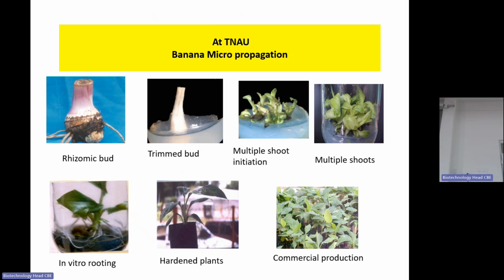Apical dominance destroyed. So you gave a vertical cut. Did you? Yes. Why a vertical cut? Multiple shoots. Just a vertical cut, not splitting it. Just a vertical cut, so you reach this meristem and you destroy the meristem. When you destroy the meristem, there will be no apical dominance. So you get many shoots, multiple shoots, all from the side axillary buds.